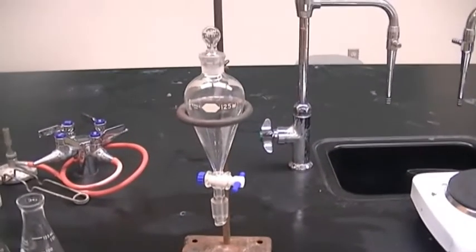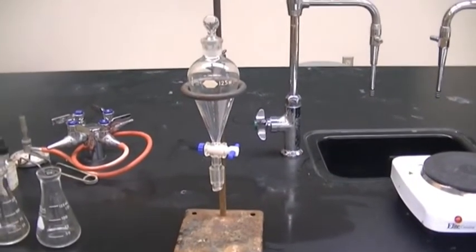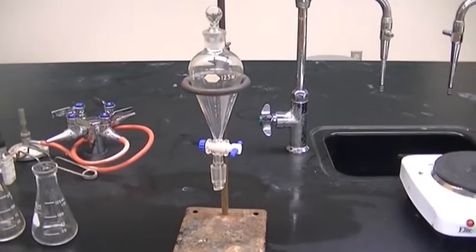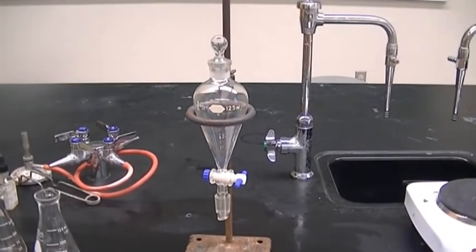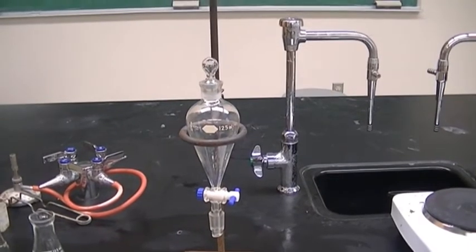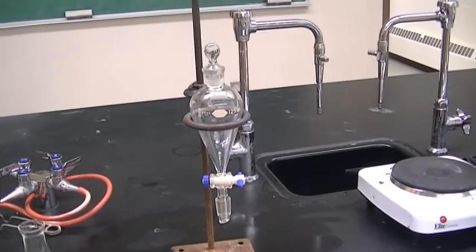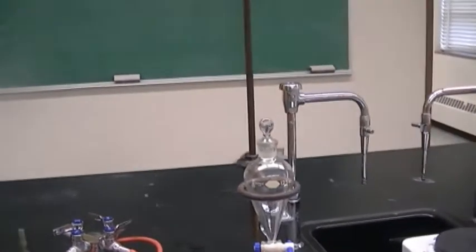And then our new piece of equipment that we haven't used yet, and that is a separatory funnel. So it is a pear-shaped funnel. And when we do our extractions, I will give you the rules for using our separatory funnel. All right, so let's begin the experiment.